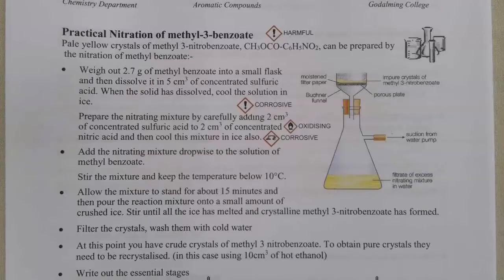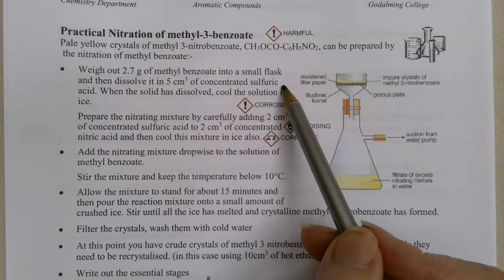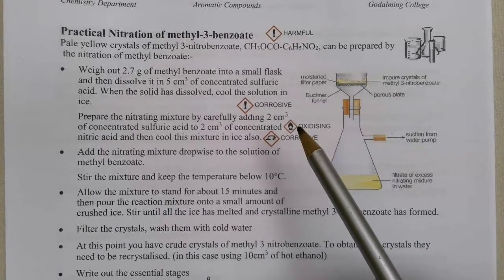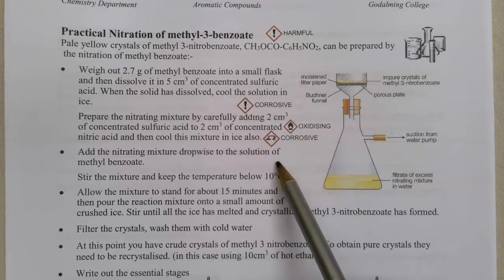So in this practical, you're going to weigh out a small amount of methyl benzoate. You're going to dissolve that in concentrated sulfuric acid and cool that in an ice bath. Generally speaking, we will usually prepare the nitrating mixture for you because that takes quite a long time to get it cool enough. Then, the difficult bits.